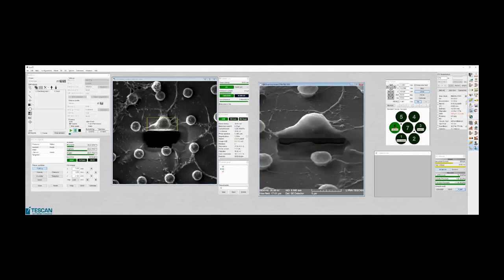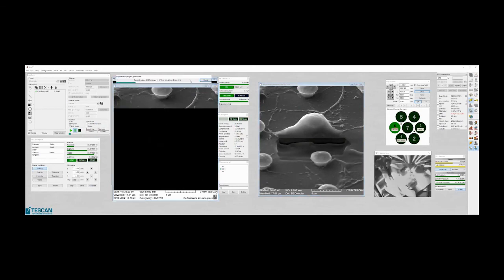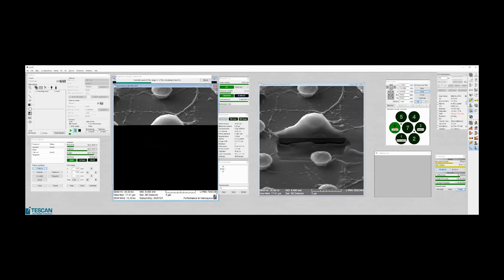So now, even without any huge material contrast, we can see some pores here. So if I acquire it, and I compare it with the next one, you can check it. The amount of images and how big steps for this polishing you are doing depends on your own preferences.